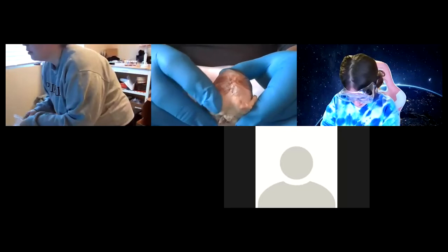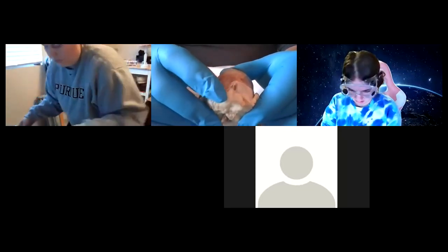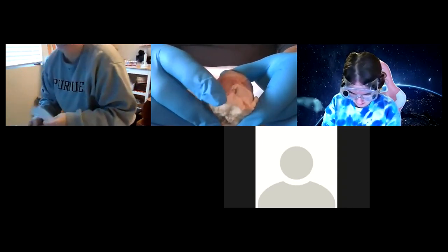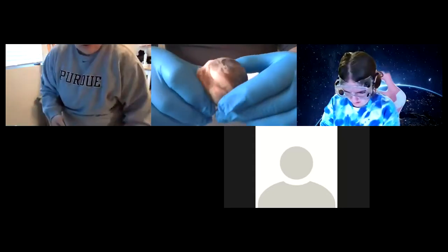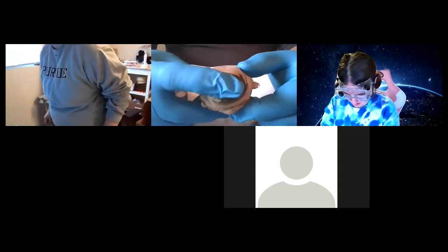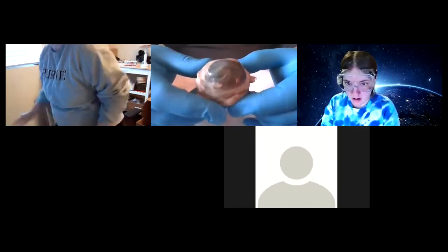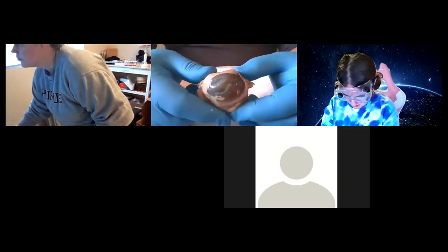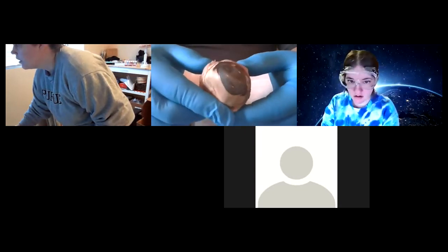There is some muscle tissue around the eye. You'll learn the muscles of the eye — the rectus muscles and the oblique muscles that move each eye in conjunction with each other. That's muscle tissue. Now the outside of the eye — here's the cornea, which is a connective tissue membrane. The sclera is the fibrous outer layer of the eye, and that's all of this sclera — very tough tissue.